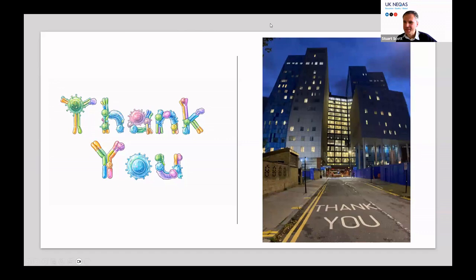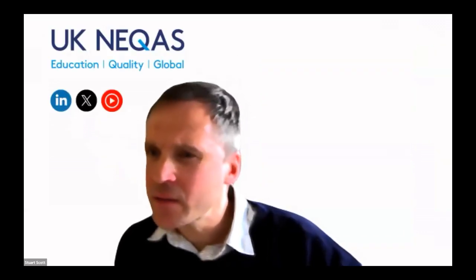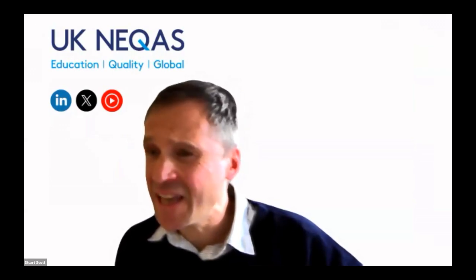Thank you ever so much, Tim. As you say, a lot of food for thought there. We're running a little bit behind, so I'm going to limit this to one question, if that's okay. So there is a growing interest in AI-assisted gating and population identification. How confident are you that these tools are ready for routine diagnostic use, and what safeguards do you think are essential before widespread adoption?